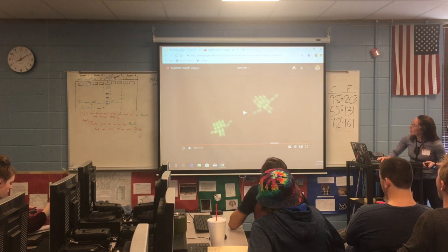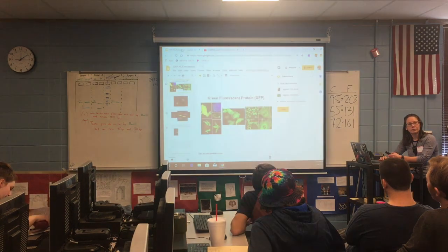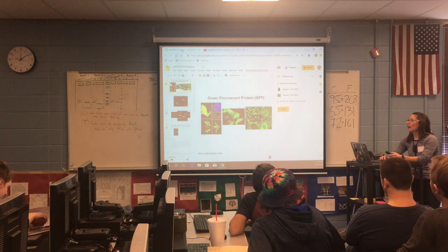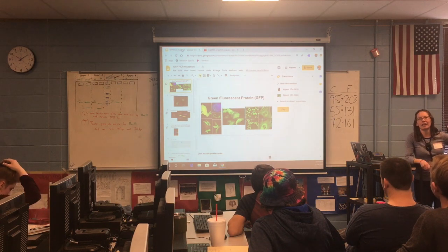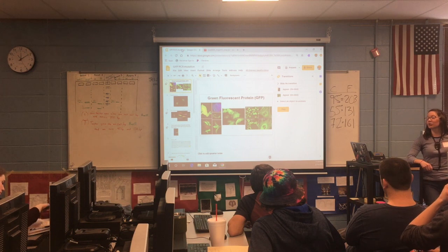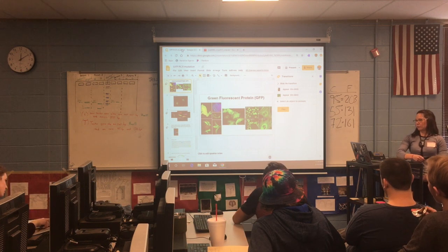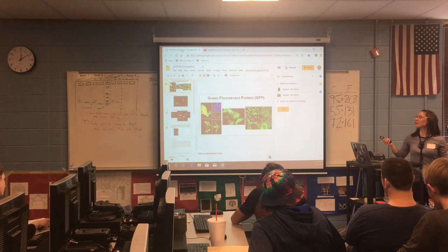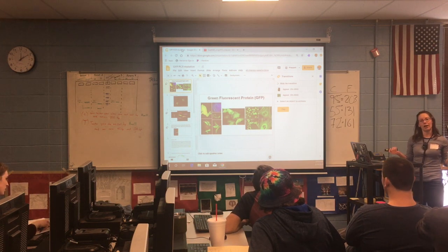Kristen, you said that it's expensive, like the reagents are expensive. On what level of expense are we talking? So I cheaped out on you guys, and I split a 10 reaction kit into 16 reactions. That kit was $500. So the types of biology to do the things that we want to do, it's expensive.